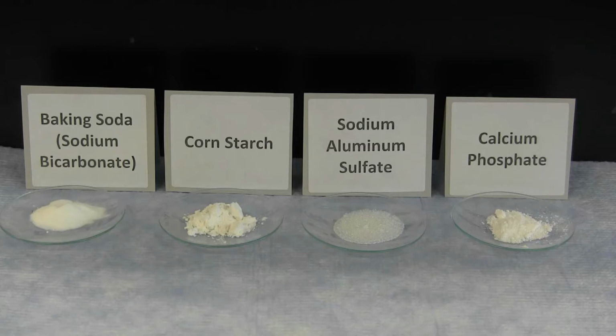The 4 components that make up baking powder are baking soda or sodium bicarbonate, cornstarch, sodium aluminum sulfate, and calcium phosphate. All 4 of these components are white powders, and when blended together, they comprise baking powder. The first part of this experiment focuses on determining the percent composition of baking powder and figuring out what percentage of baking powder is comprised of baking soda.